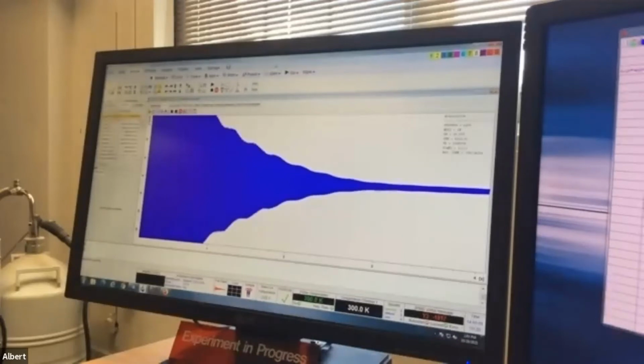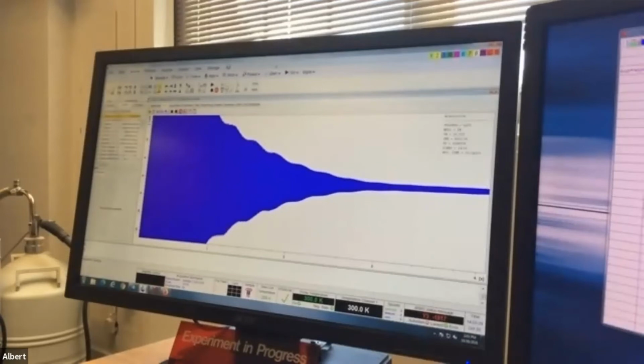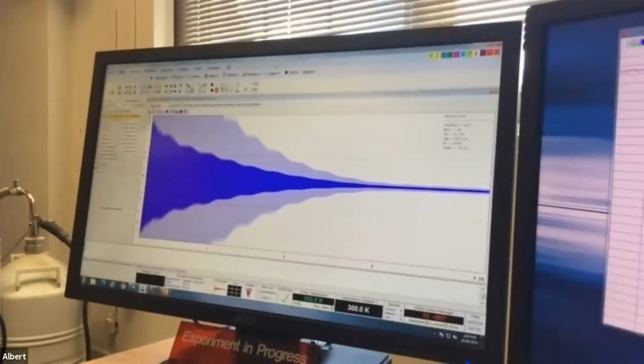All right, so now we're at 13 scans. And this is a good sample too. If it was not really concentrated, that FID would be a lot more fuzzy around the edge, like here. It'll look bad. That's how you know your sample is not concentrated enough. All right, so now that's done.